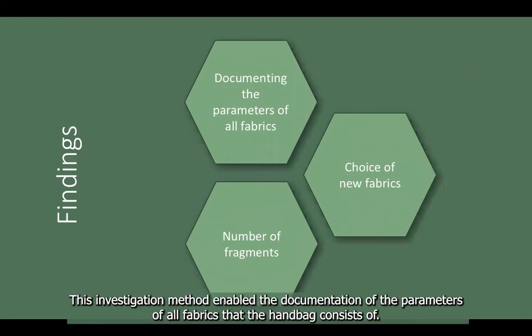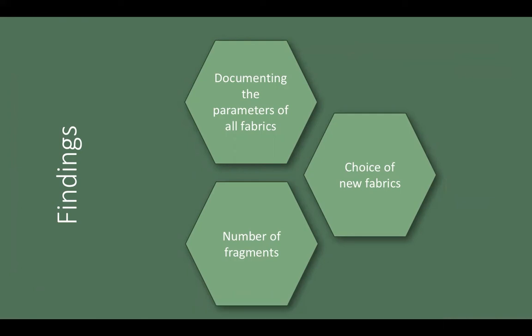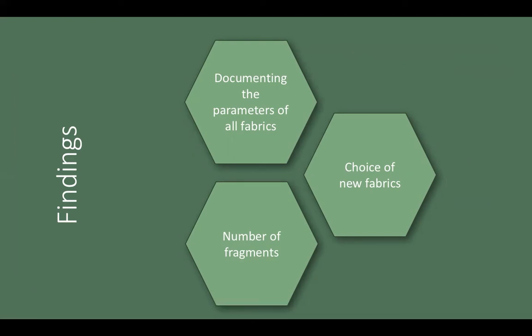This investigation method enabled documentation of the parameters of all fabrics that the handbag consists of. This information also helps with the choice of new fabrics for consolidation and support of the original historic textiles. The parameters also show that the 3 red fragments are made of the same fabric, as well as the 2 white fragments, due to the fact that the parameters of those fragments correspond with one another.